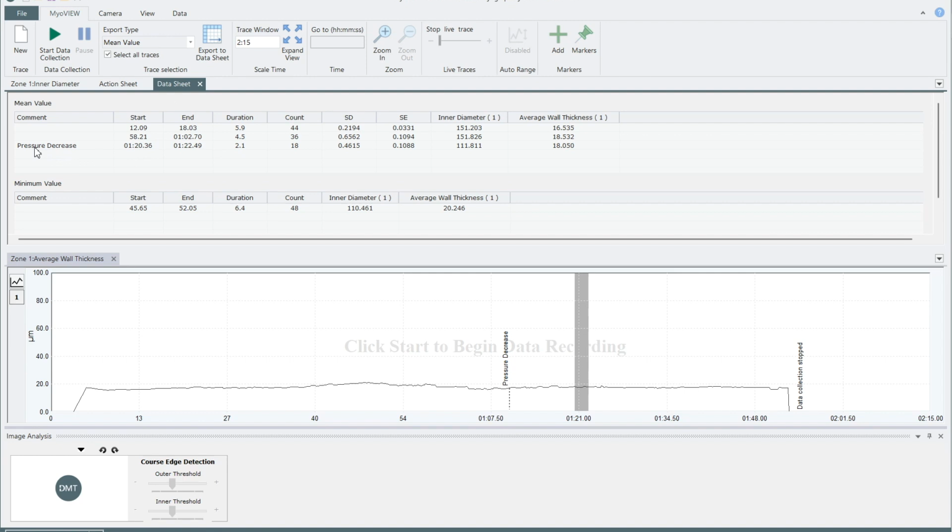If you utilize the comment feature during your experiment, the closest comment before your selection will be added to the measurement. Now, when we view the datasheet, we will see the last three selections that we made, including the minimum value selection below, and the last selection that also includes the comment. You can take these measurements during data acquisition or after, it makes no difference.